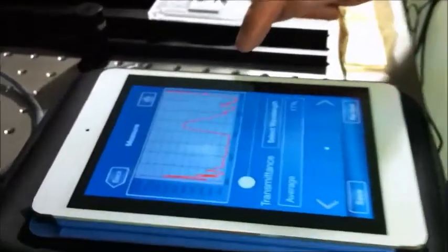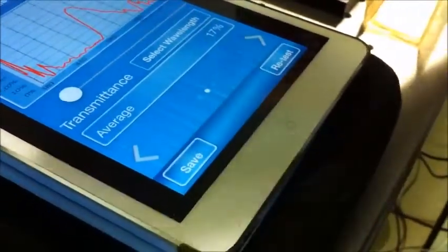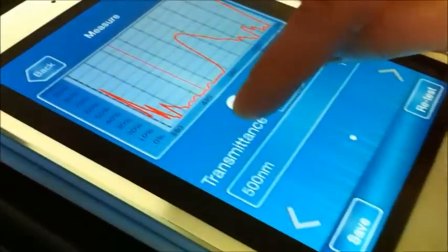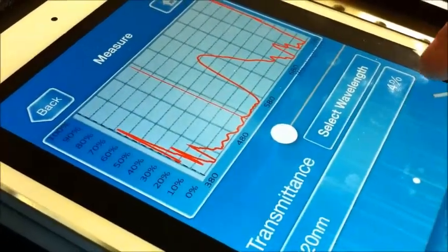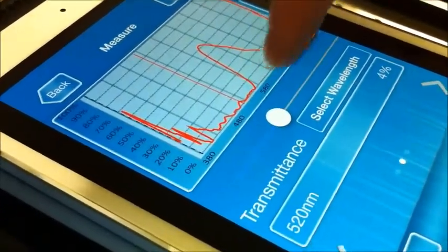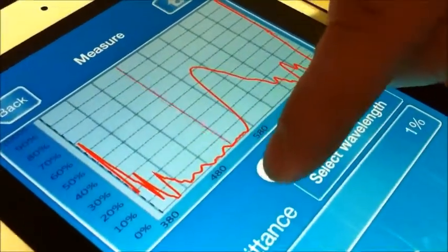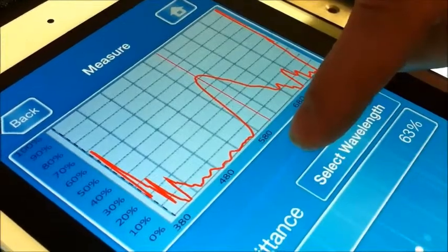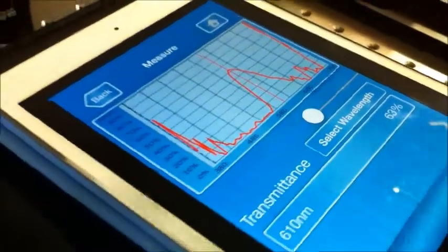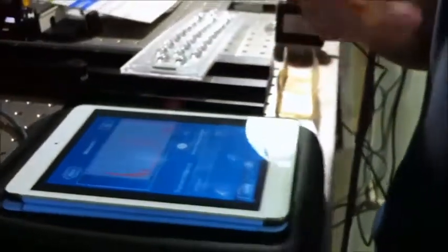Furthermore, you can see here only the bandpass filter itself. You could use this to go anywhere in the spectrum to see the actual transmission ratio. Here almost no light is coming through — there's a little bump here at 4%. Moving further: 2%, further more 0%. And then at the peak, we can see 63%. So it could be a really useful tool to do some QC quickly when you have optical components incoming to your facility, for example.